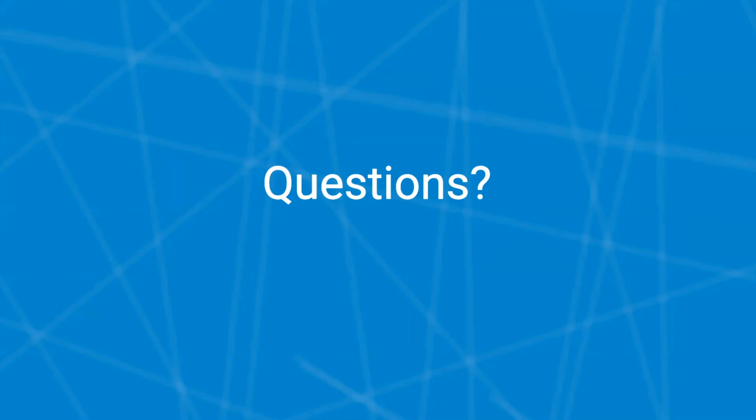So we've got another question from a LabKey server user that's familiar with the study module we talked about at the beginning. Can we copy these assay results to a study? And the answer is yes, because the underlying data structures that LabKey Sample Manager sits on top of are LabKey server general purpose assay designs. And so if you have access to LabKey server as well as Sample Manager, you would be able to upload the assay results in Sample Manager, navigate into LabKey server, and copy those into a study.